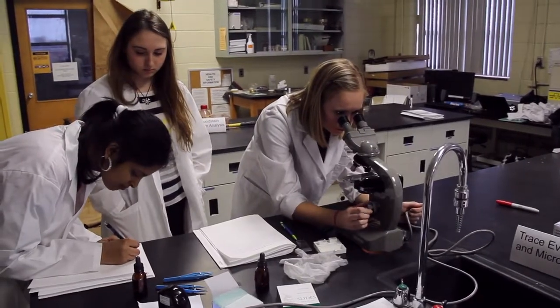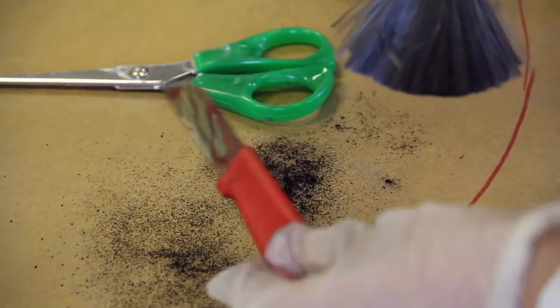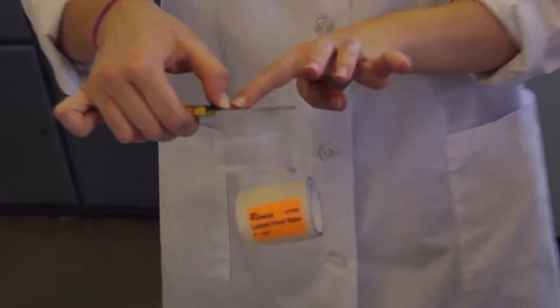First we took all our fingerprints with the ink, and then afterwards we fingerprinted the surfaces and then dusted them and then lifted them with tape to compare.